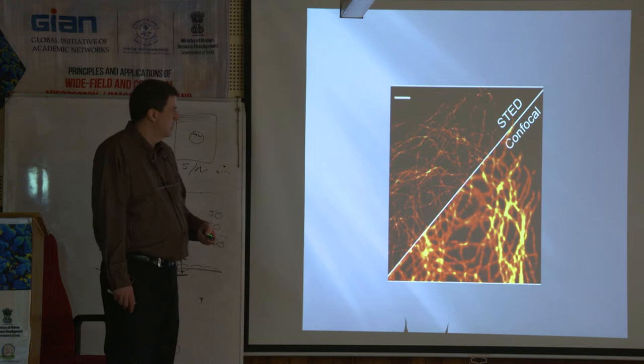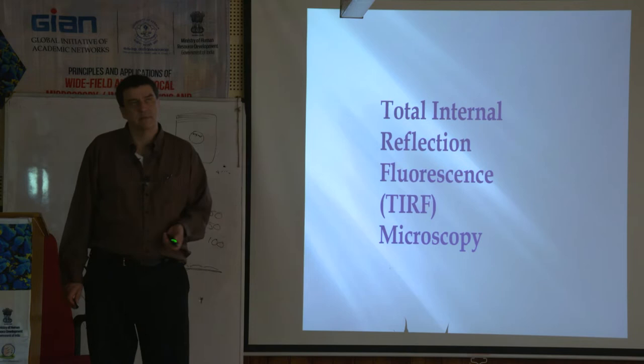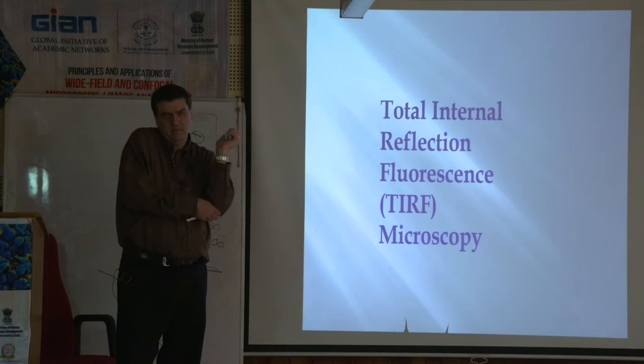Okay, TIRF microscopy. Again, this is a very specialty thing. I know there's one at the Cleveland Clinic, which is in Cleveland, close to where I work, Case Western Reserve. I tried selling these in the past. They were really hard to sell because the application's so narrow that unless that person was working on something very specific, it was really hard to sell.